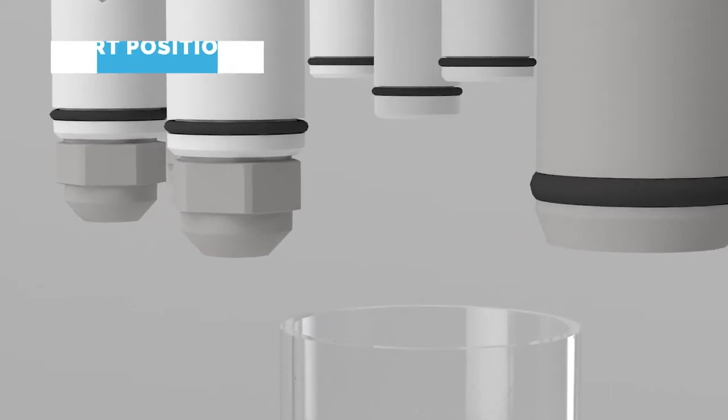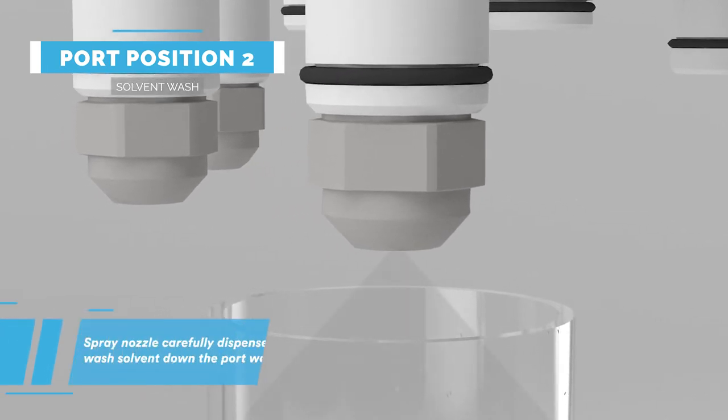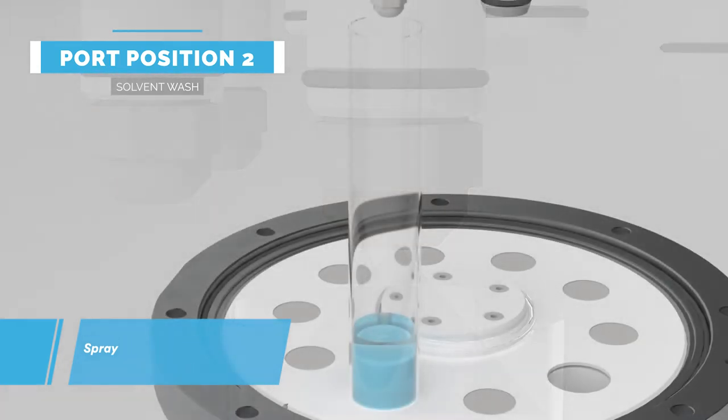The carousel then indexes round to the washing stages. A spray nozzle dispenses wash solvent down the wall of the tube preventing disturbance of the cake.